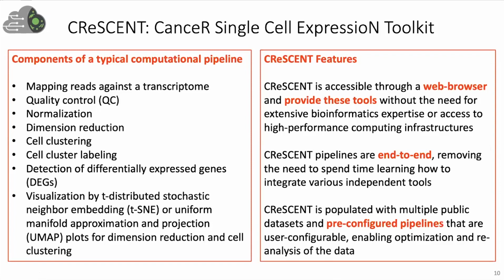We have collected and put several public data sets in Crescent, and multiple public pre-configured pipelines and modules are available through Crescent. So the user can basically use them and do the optimization and reanalysis of the data if they want to.